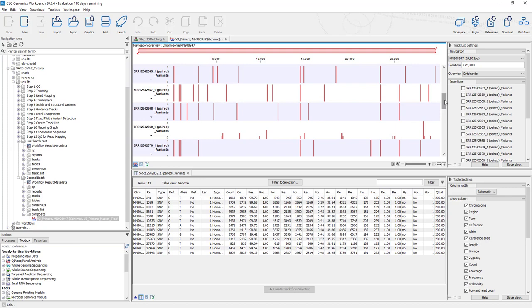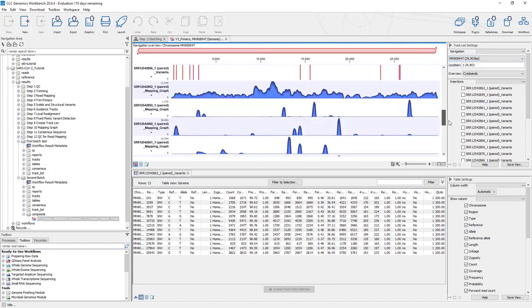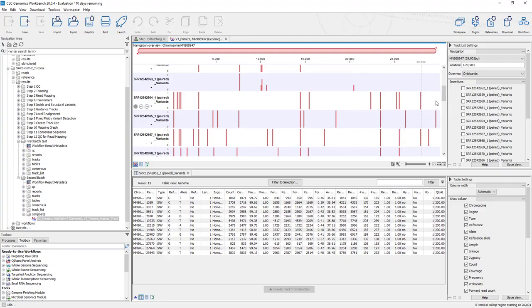So this is the tool that you really want to use when, if you have SARS-CoV-2 sequencing runs on your Illumina and you want to QC and look through your whole list of specimens to see which ones passed and which ones failed, you could use this type of view and go in. You can go in and look at the variants that are shared, and it's the way that we're building things now. We're going to use these types of iterate and collect and distribute to also collect our consensus sequences for data sharing. We'll use it to select sequences and feed them into phylogenetic analysis, and lots of other really neat tools for SARS-CoV-2 sequencing.